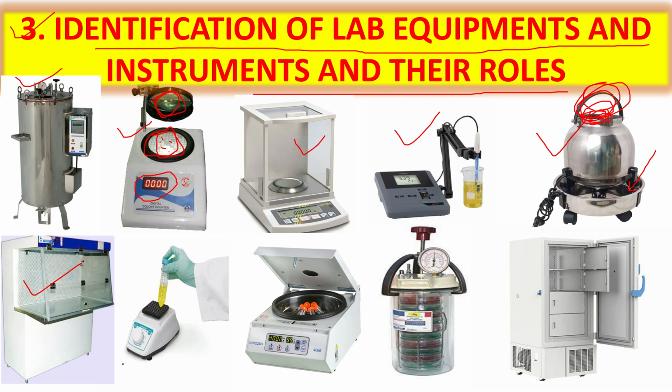Okay, so next thing is a vortex shaker or vortex mixer, used for mixing any solution. Okay, next thing is a centrifuge machine. So centrifuge machine is used for centrifugation, and here the centrifuge tubes are present where you put your solution, and for centrifugation we have to set the rpm and also the time.